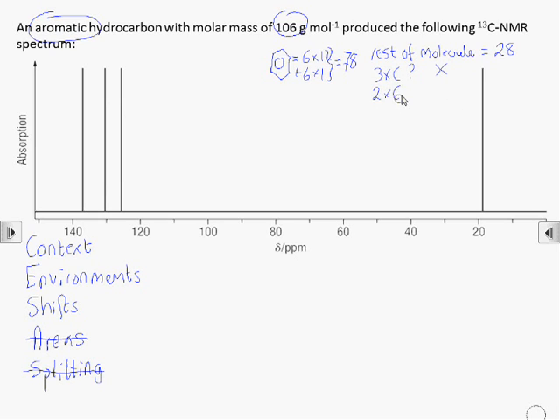It could be two carbons, so that's 24 plus four hydrogens, or I suppose it could be one carbon and 16 hydrogens, but that seems a little unlikely.